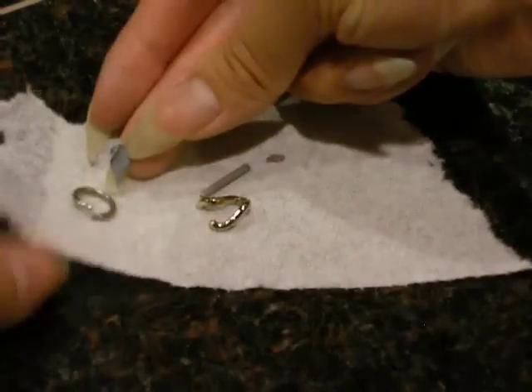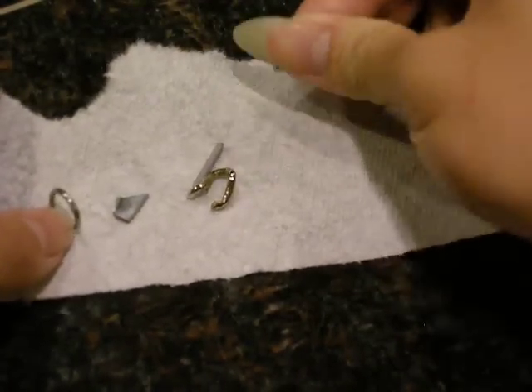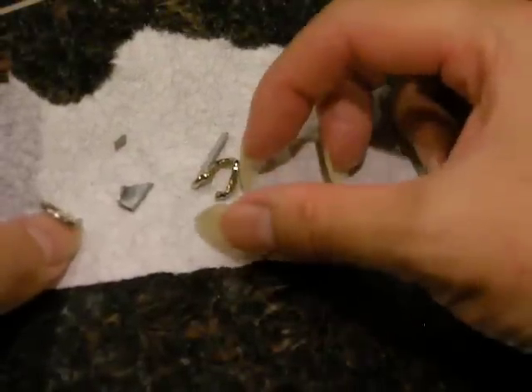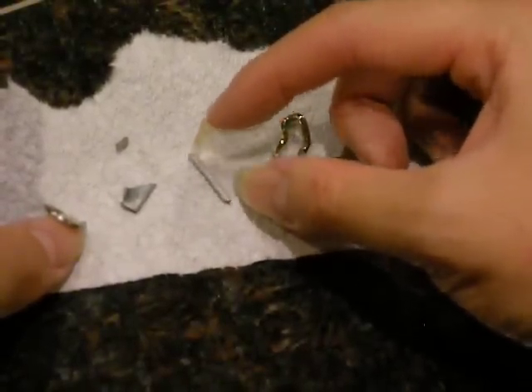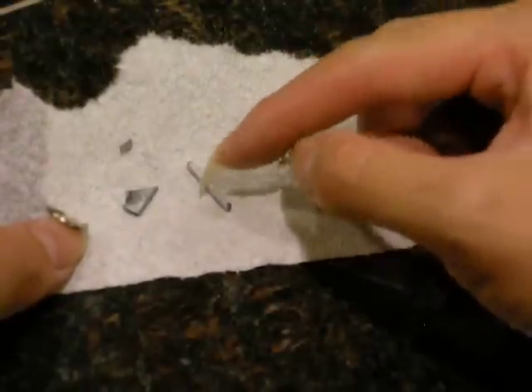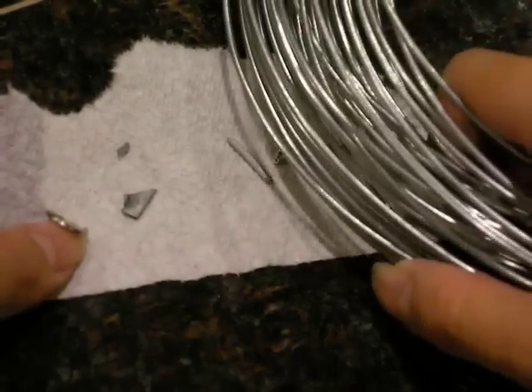The zinc piece that I originally started out with was about that size. After about half an hour, that's what is left. This is the galvanized steel — it's developed the white zinc rust that you hear about every now and then. And this is the spool that it came from.